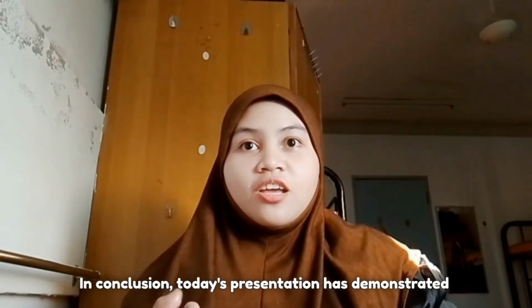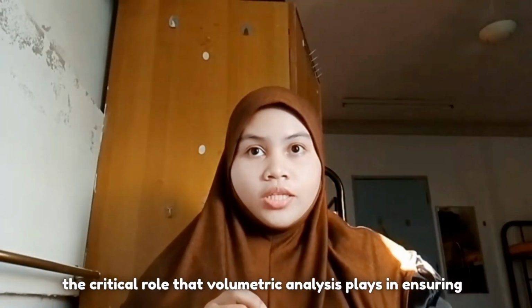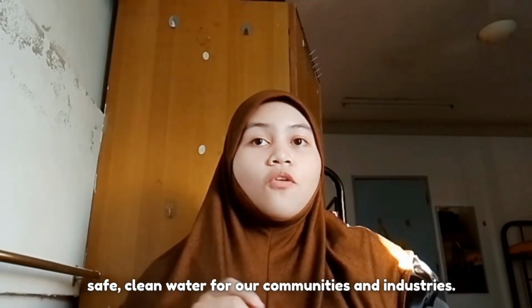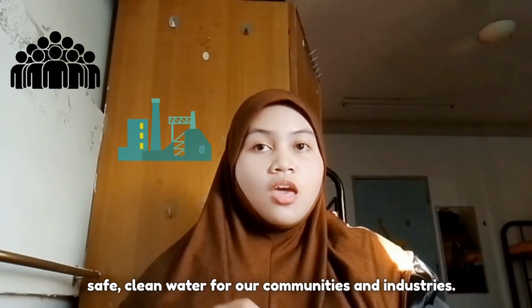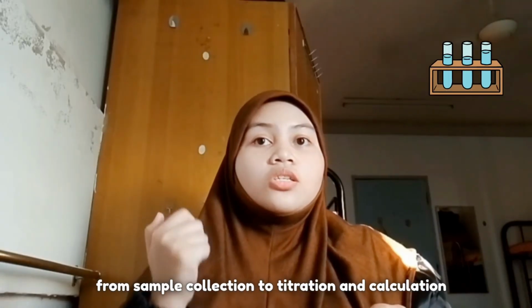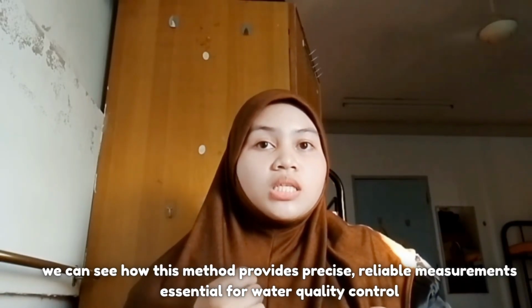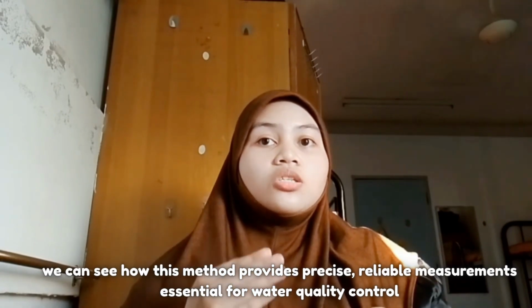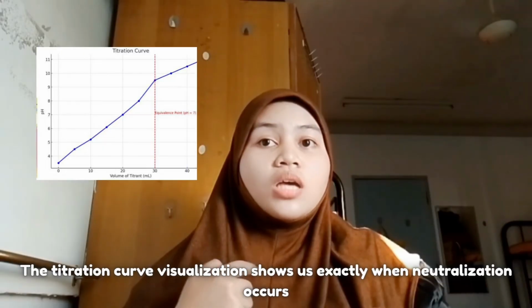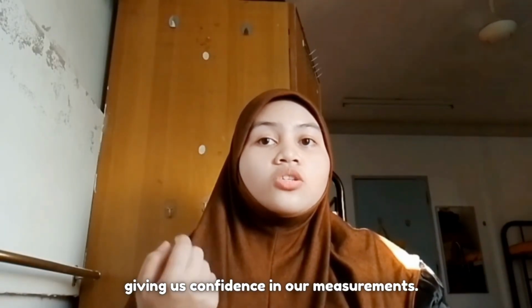In conclusion, today's presentation has demonstrated the critical role that volumetric analysis plays in ensuring safe, clean water for our communities and industries. Through the systematic processes we've outlined, from sample collection to titration and calculation, we can see how this method provides precise, reliable measurements essential for water quality control. The titration curve visualization shows us exactly when neutralization occurs, giving us confidence in our measurements.